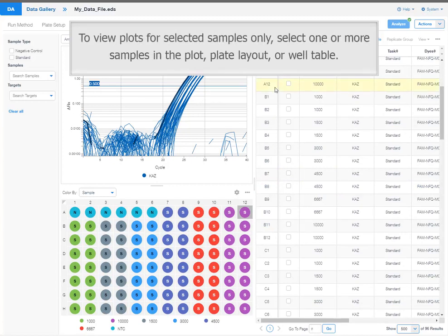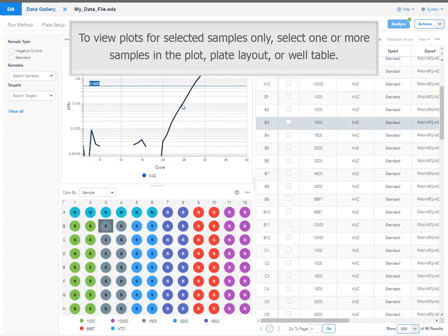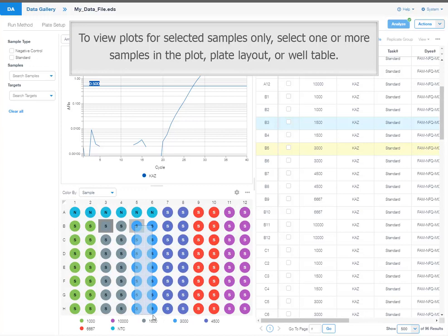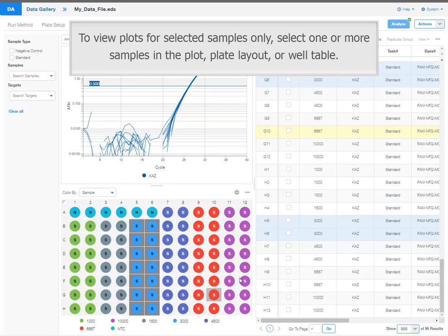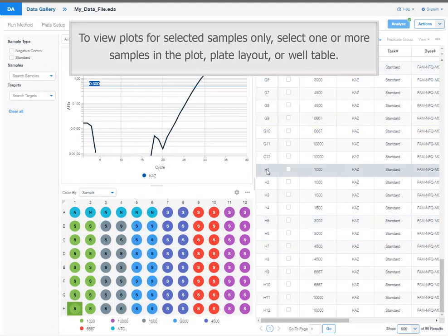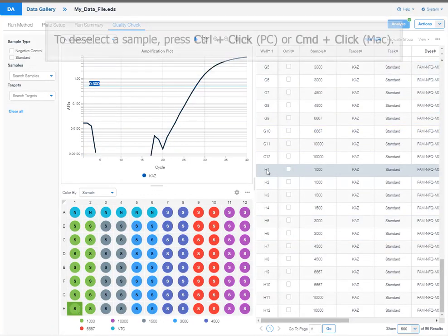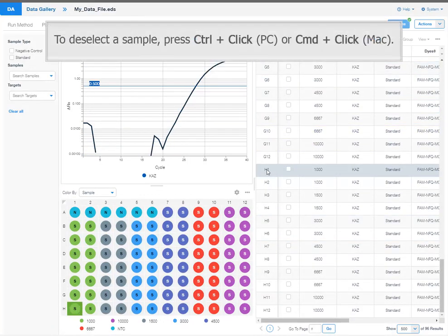To view plots for selected samples only, select one or more samples in the plot, plate layout, or well table. To deselect a sample, press Ctrl click or Command click.